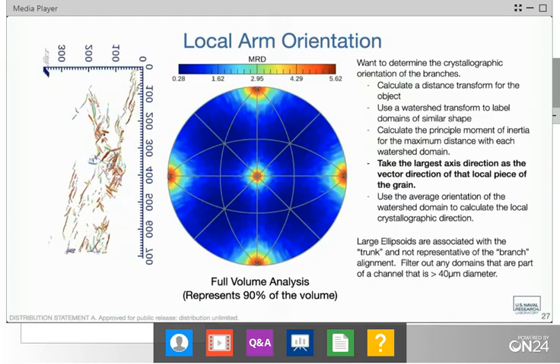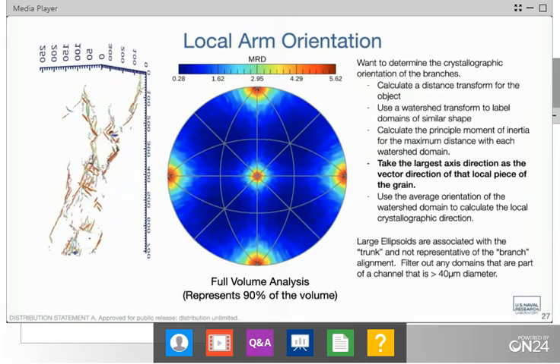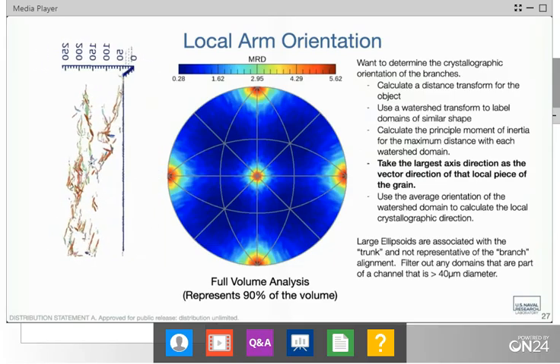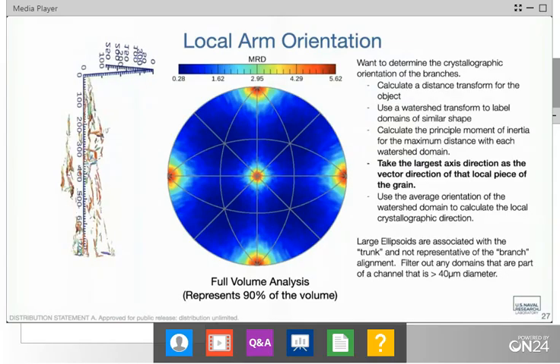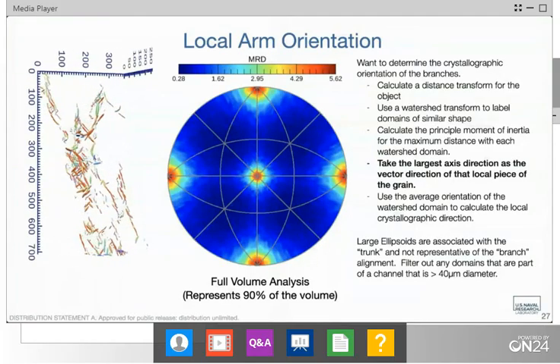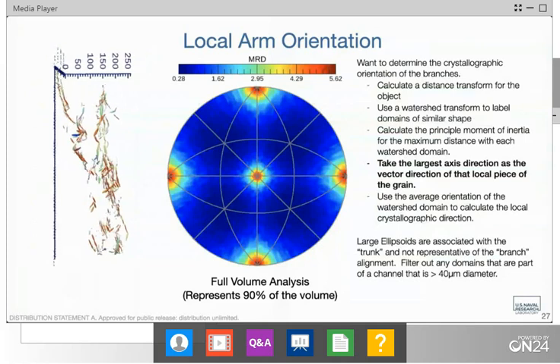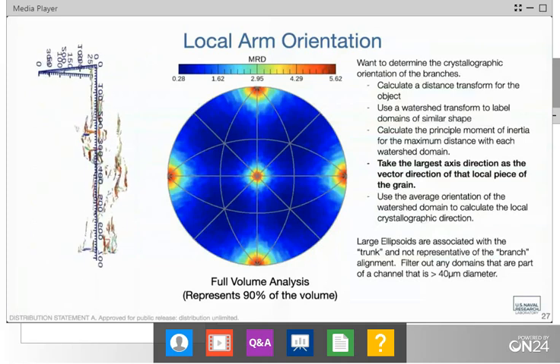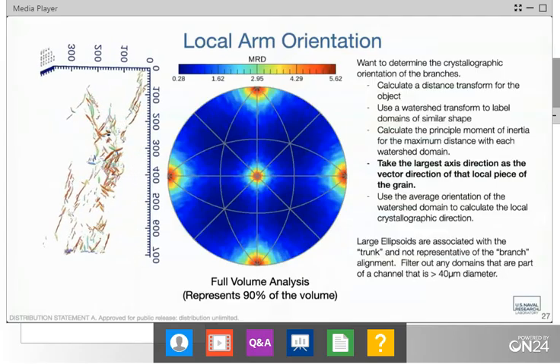The Hall-Petch relationship is really based upon space-filling, nice equiaxed grains. Here, we could do a very easy measurement of the average distance to an interface. It requires reformulating things a little bit, but it's not that hard to calculate. We can take every voxel within the structure and ask what its minimum distance to an interface is. I think that might be really advantageous.